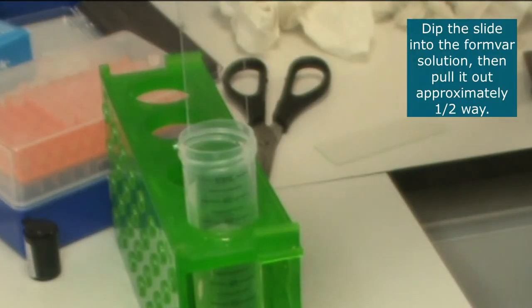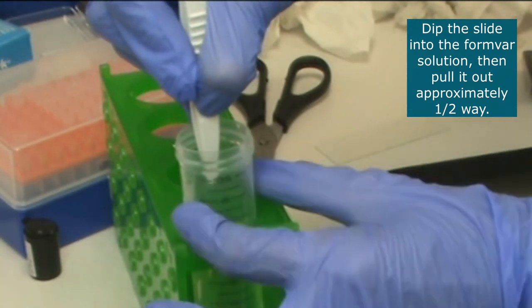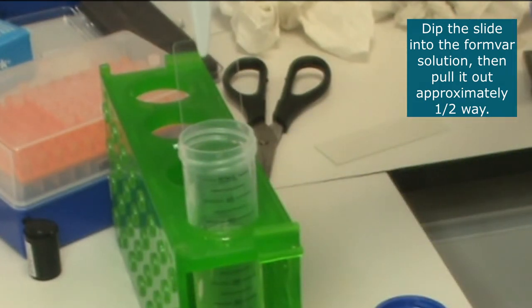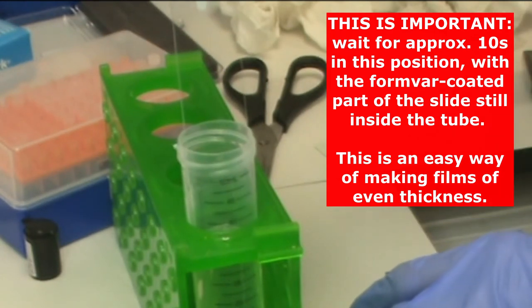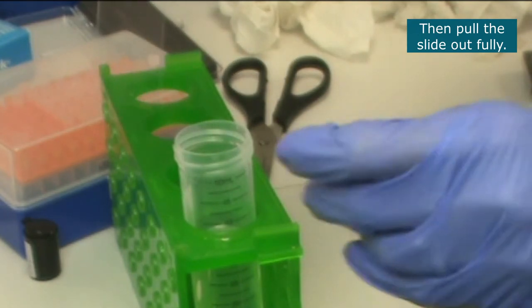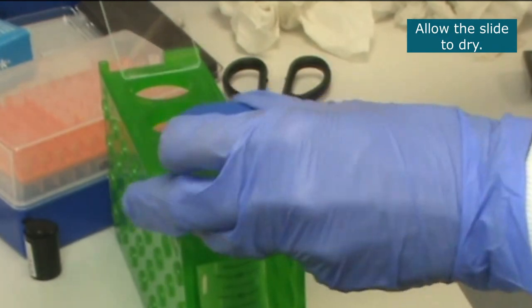Dip the slide into the formvar. Pull the slide out about halfway. Wait for about 10 seconds. And then pull the slide out completely and allow it to dry.